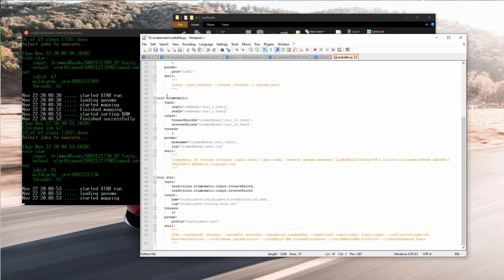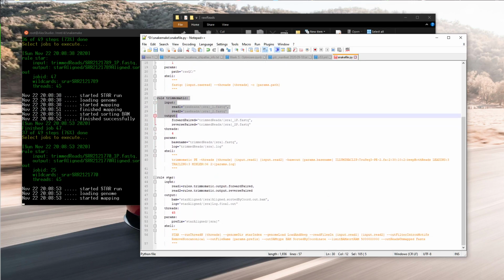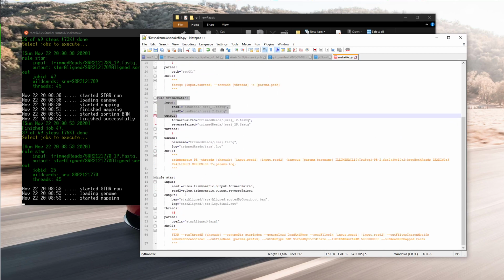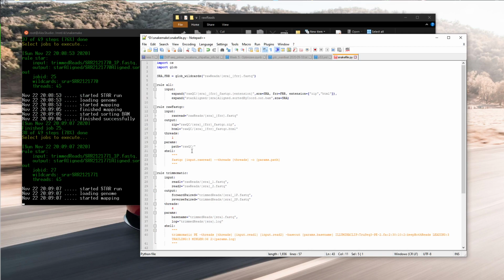And then you can always go through and do a rule QC for Trimmomatic. You can do MultiQC in here. Like I mentioned at the beginning, you can do a rule to do the STAR index. You can do things like a config file, and in that config file, you can specify particular threads. You can specify your input files.